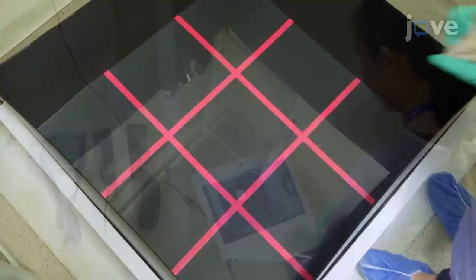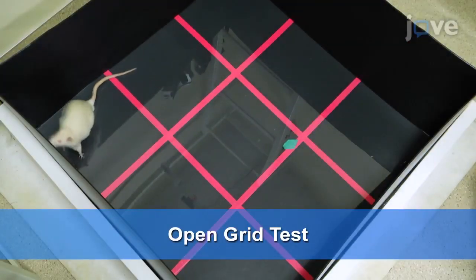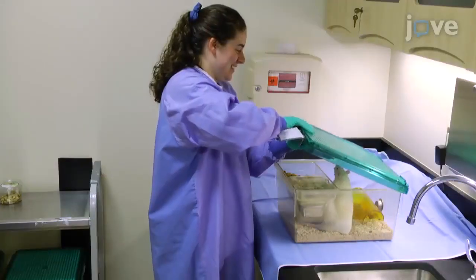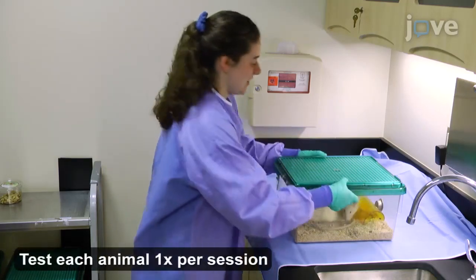Begin filming and place the animal in the center of the grid, facing away from the researcher, to begin the grid test. Allow the animal to run freely for three minutes while being video recorded from above. Stop filming when the three minute time period has ended and return the animal to its home cage.